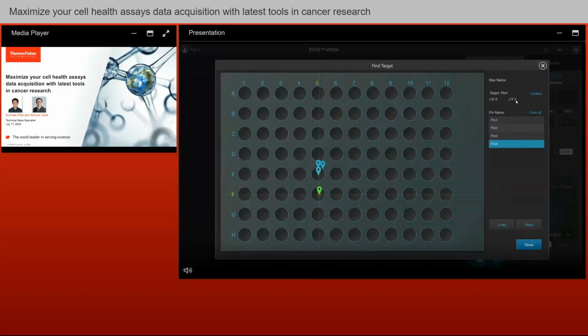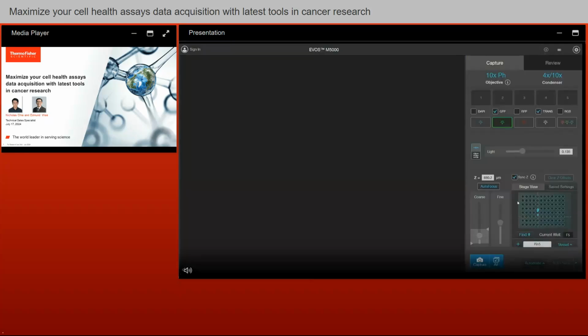There we go. Delta is 00, the exact position of the pin that we added for the well. So let's say if you want to work with the whole well, you can actually add more pins. At the vessel map location here, you can add the pins according to the location of the cells. You can also rename them so that it's easier for you to identify the locations.